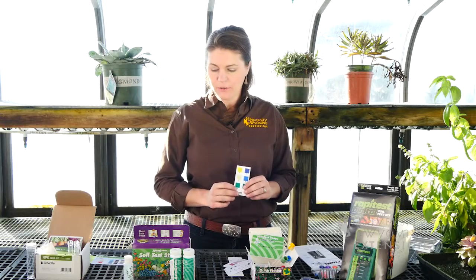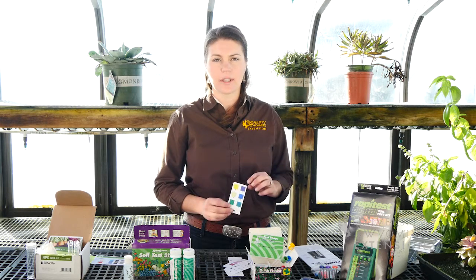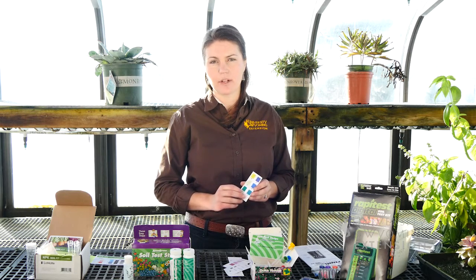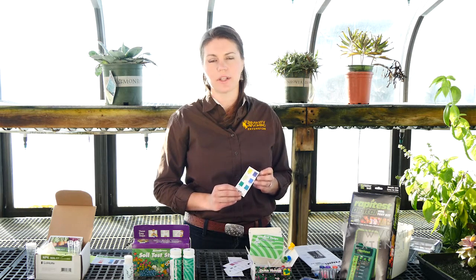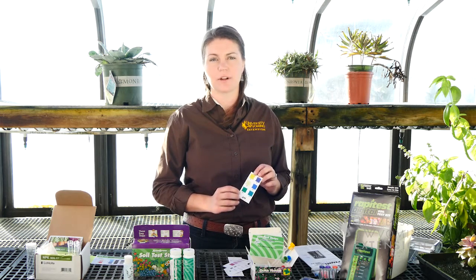These kits are generally available for under $30 at most garden stores or you can order them online, and there are also other kits available. These results won't be as precise as sending them into the lab for analysis, but for most of us in the garden it will get us close enough and will help us determine how much fertilizer we might need to add or if we need to adjust our pH. With University of Wyoming Extension, I'm Caitlin Youngquist and you're watching From the Ground Up.